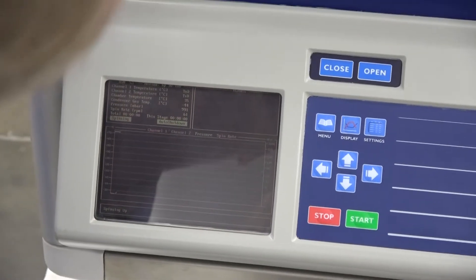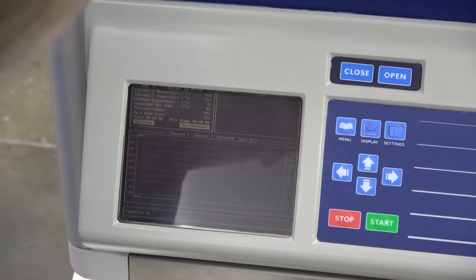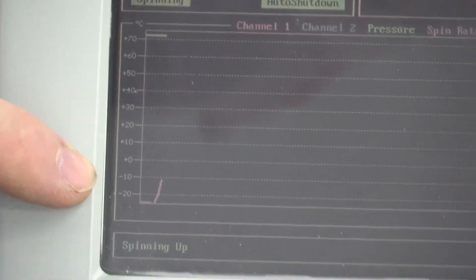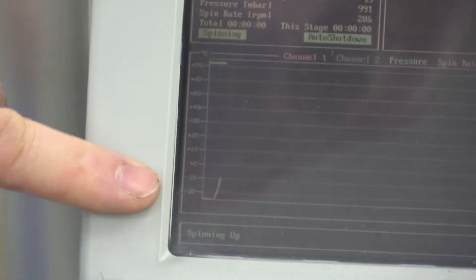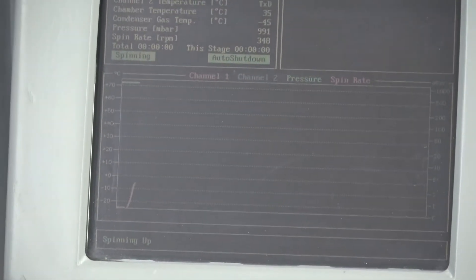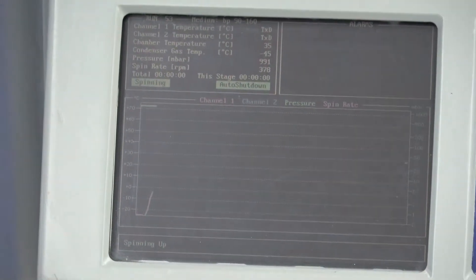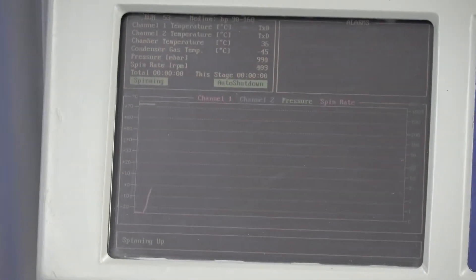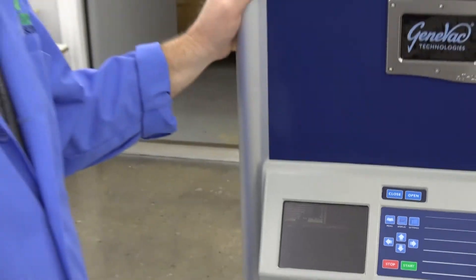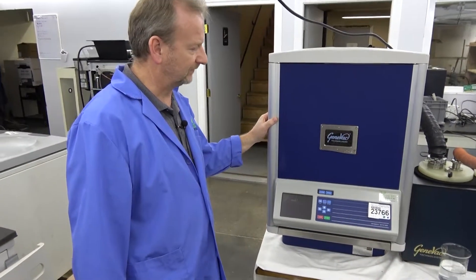It's spinning up. You can see the screen here where it's starting on the graphs already, showing the speeds. So we'll let this run a while and come back and maybe take a shot of the screen and then, of course, come back at the end of the cycle and show you how everything evaporated and went into the condenser. We'll be back shortly.